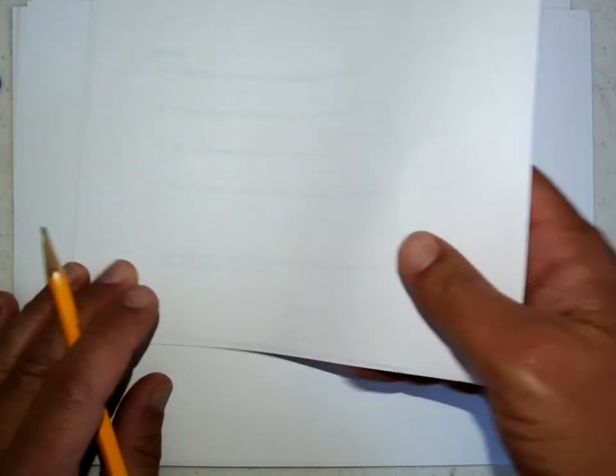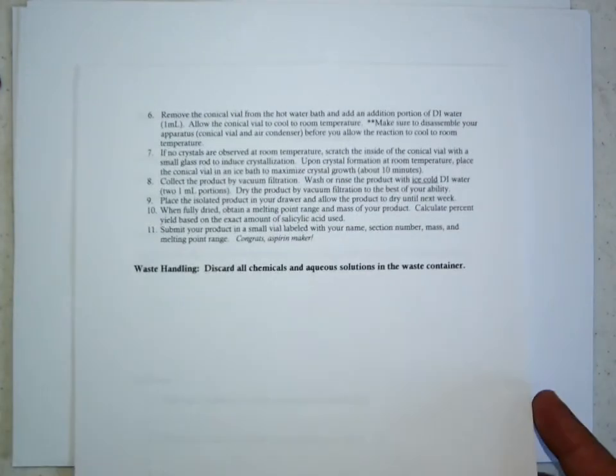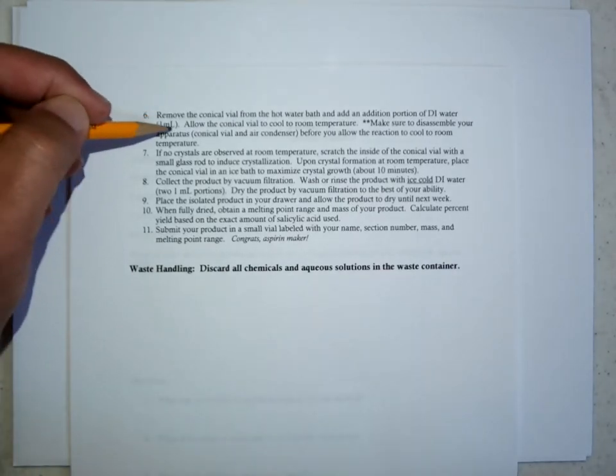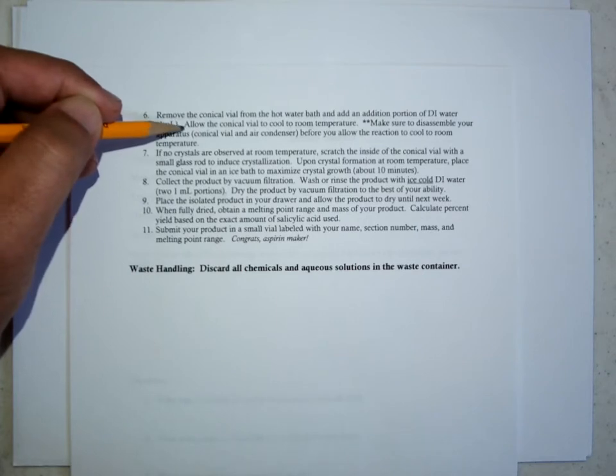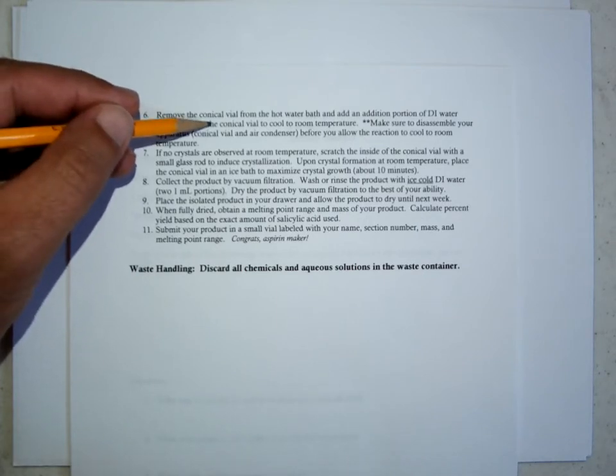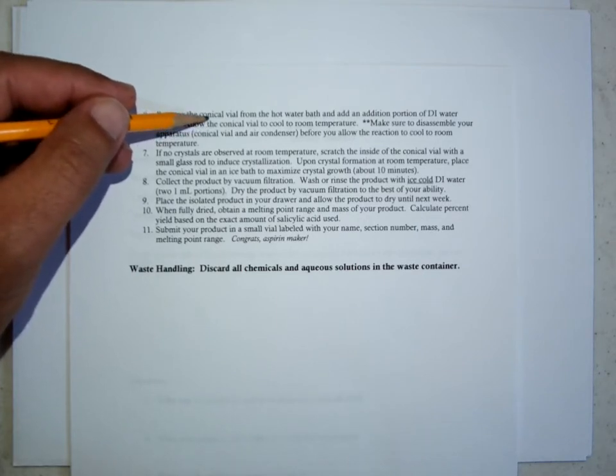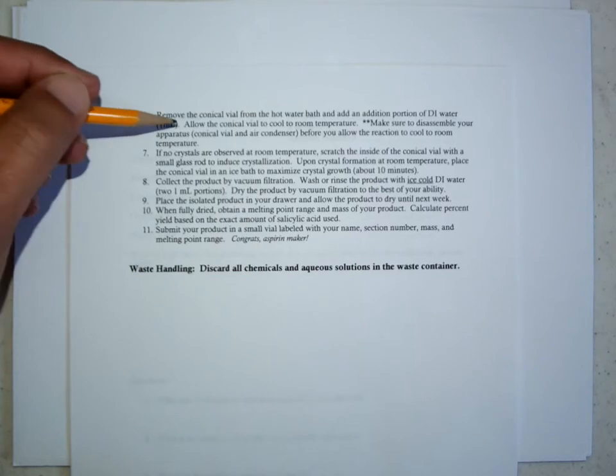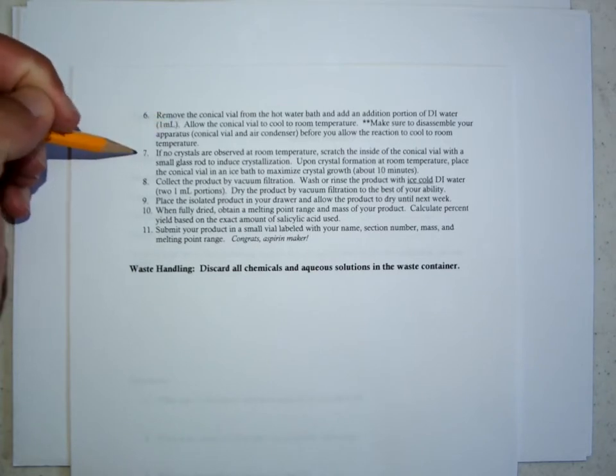And then the beauty of this reaction, one of the beauties of this reaction, is that purifying and isolating the product is super simple because if you just allow the conical vial and its contents to cool to room temperature, then take the condenser off of this, but just allow this conical vial and its contents to cool to room temperature, then crystals should form. Because in this small amount of solvent, this amount of acetyl salicylic acid will not be soluble.